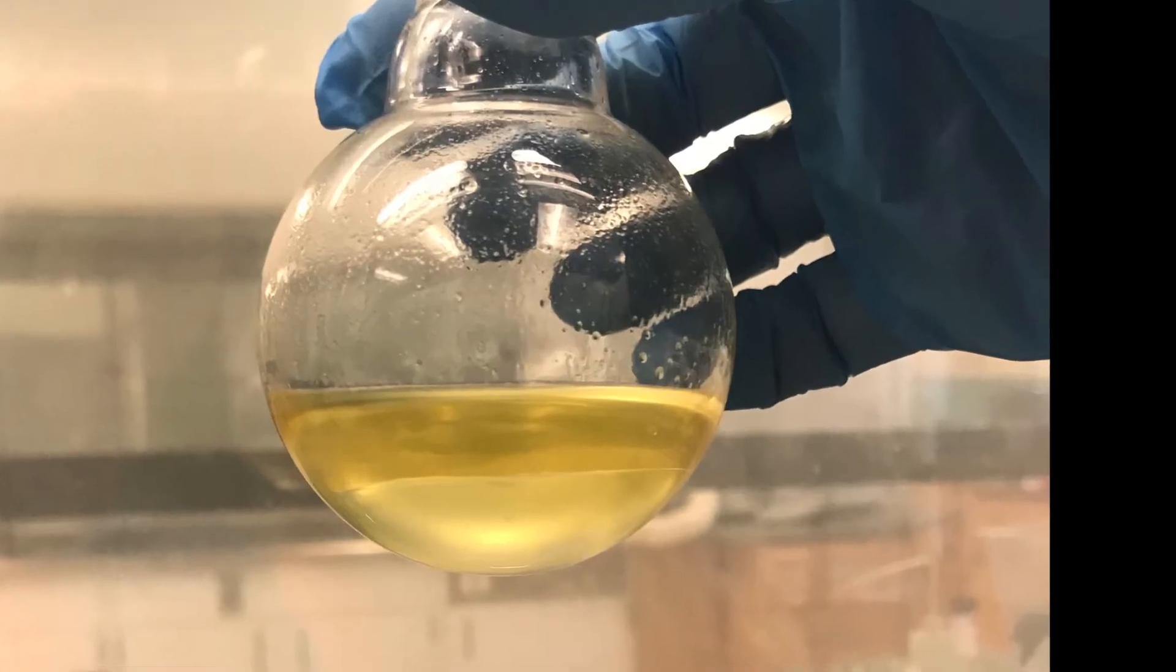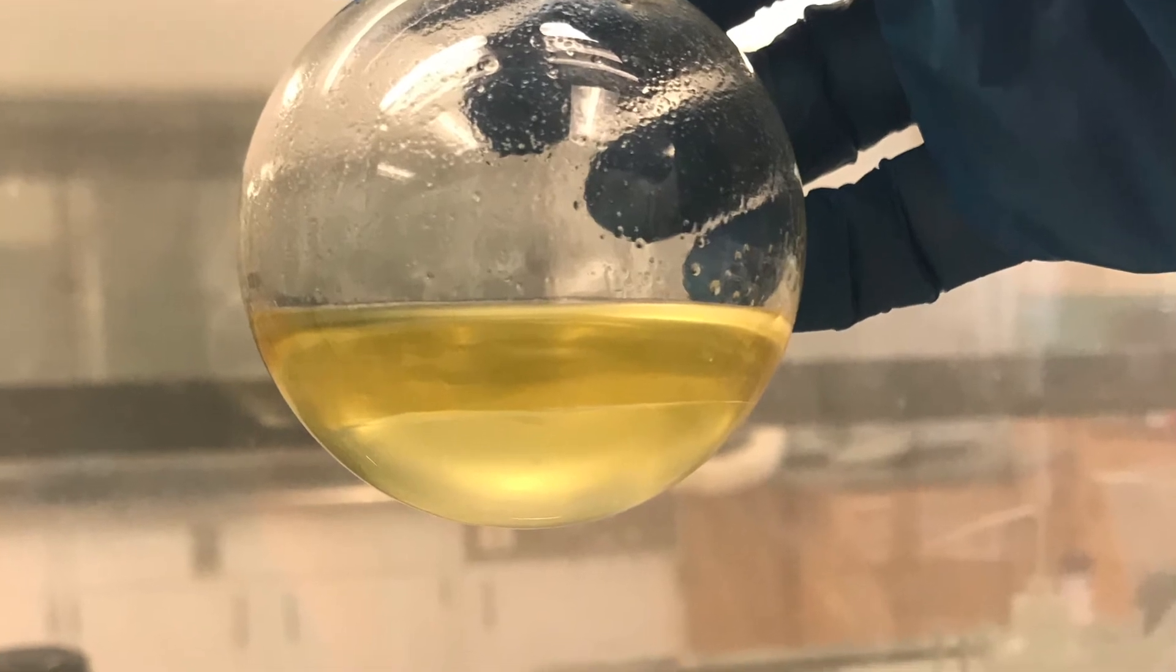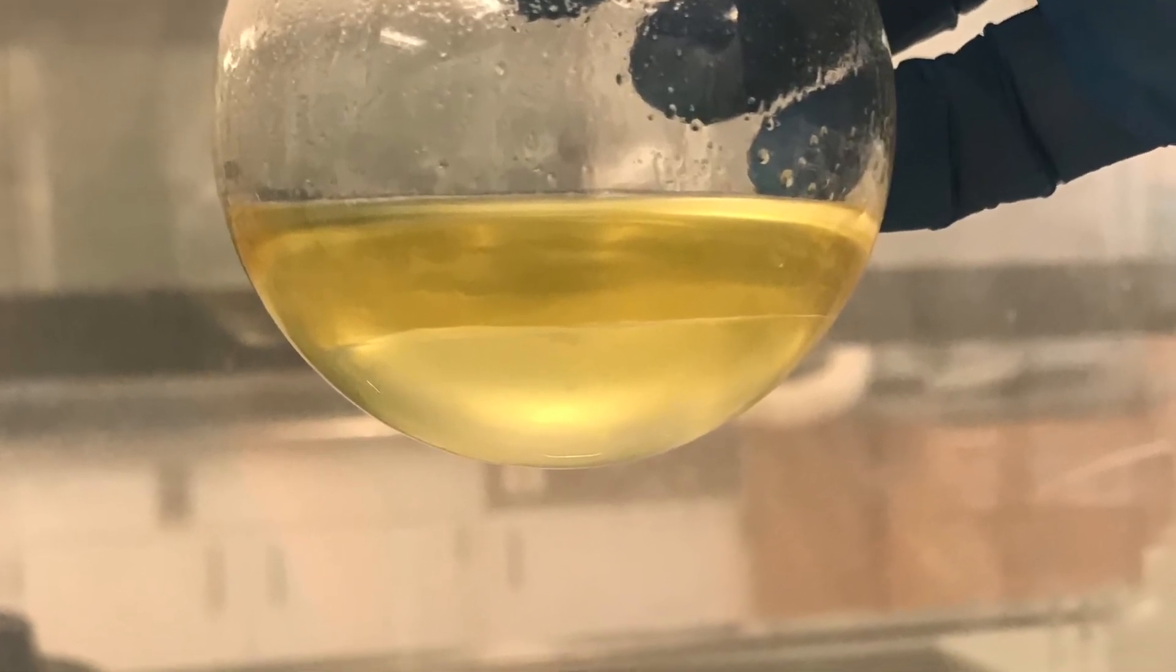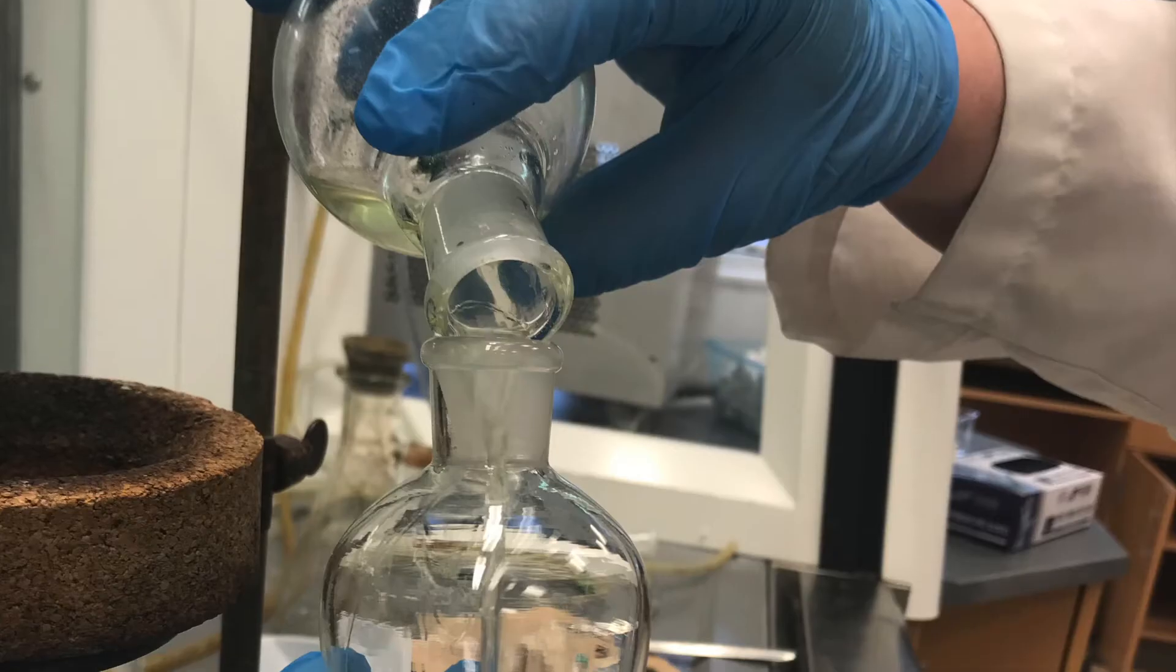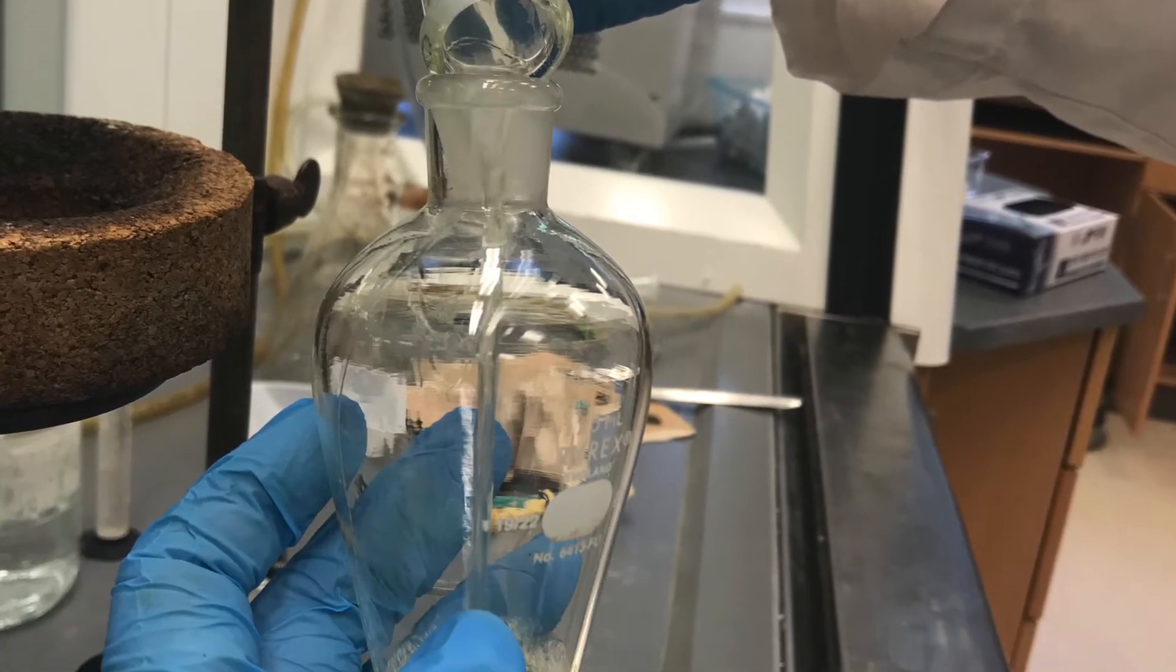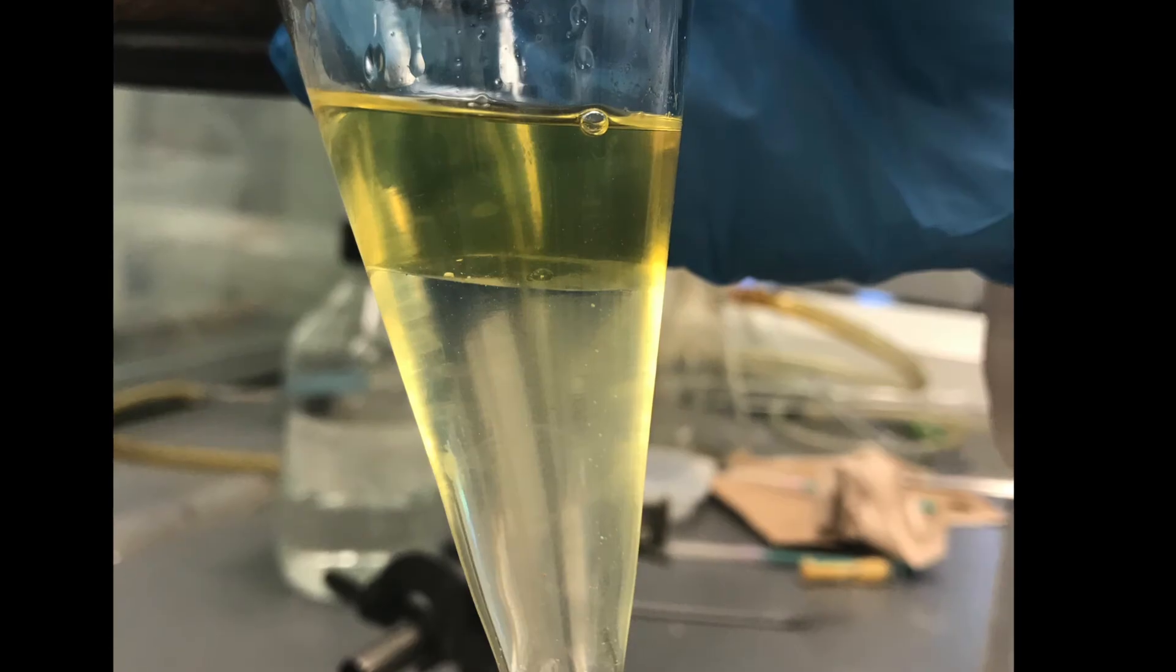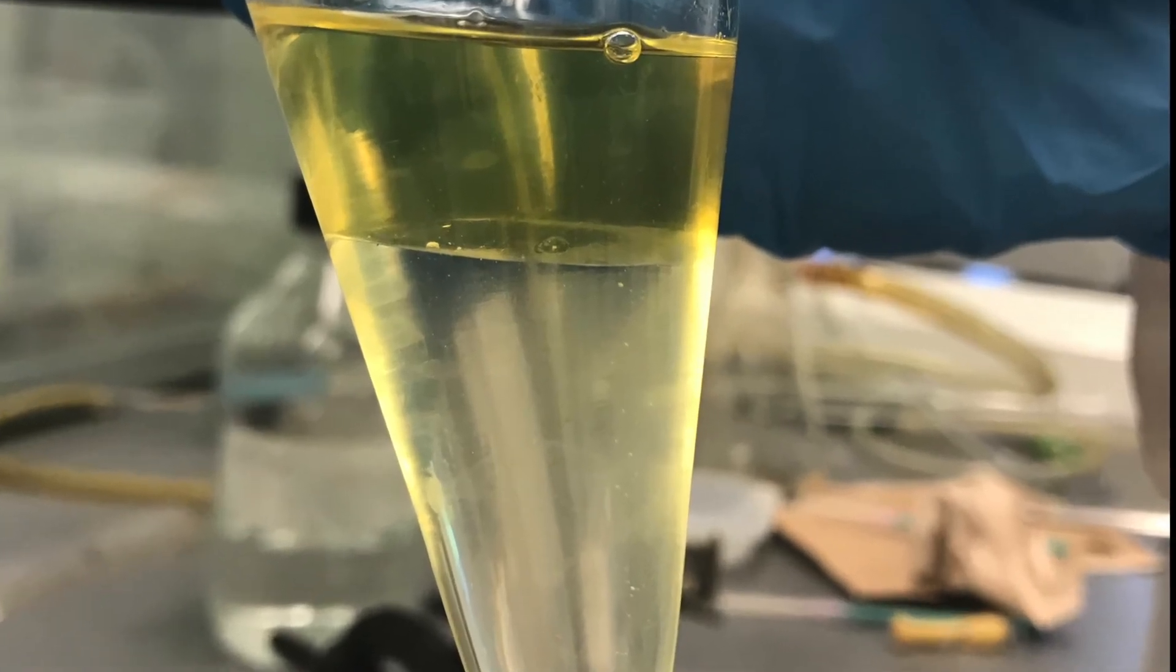I added about 8 milliliters of ether. I am able to see two distinct layers without any residual solid, so I am ready to go for my extraction. As soon as I add the ether, my product, the triphenyl methanol, will go into the ether layer, leaving all the inorganic side products in the aqueous layer.